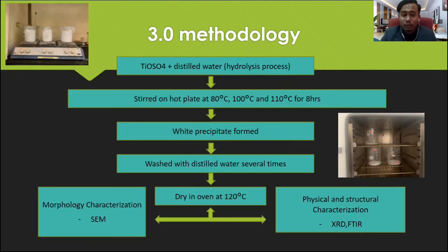And for the morphology characterization, the sample will be analyzed by SEM. And for the physical and structural characterization of the sample, XRD and FTIR processes will be deployed.